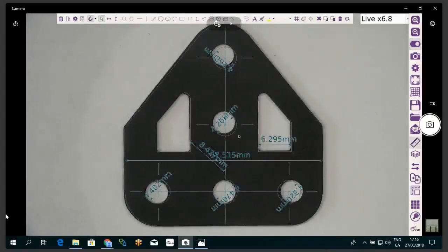And this is a really powerful feature because it means that an R&D department or an engineer can pass over CAD drawings, which they would usually have anyways. They can bring them over to production or QC. So again, it's time saving. You don't have to create your templates or your measurement files. And this file can then be used further in the automatic measurement app. It actually comes in as a vector, so the objects are movable and editable.